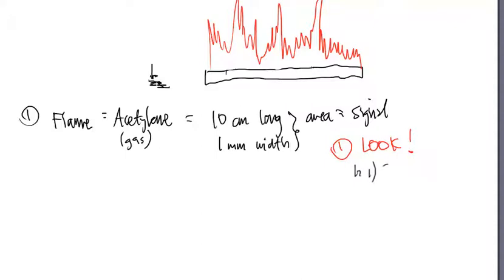Number one, do away with the splits. And the reason that those show up is because your burner head has crud on it. This is basically some type of deposit that is being settled onto the burner head, and it needs to be cleaned off. That is how you fix it.